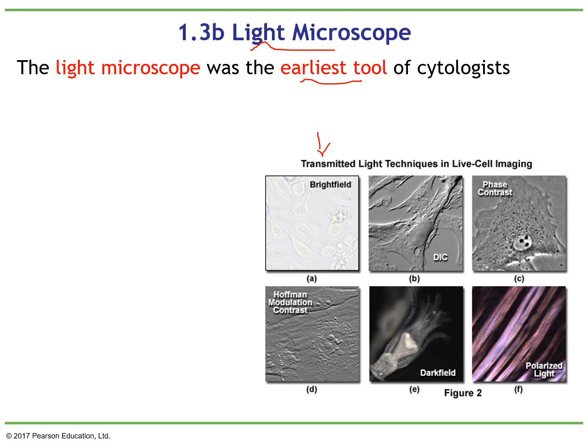You can stop this video and try to think about it: could you see in the bright field? Do you see something? Do you see what is the problem? What do you notice about this one? Question, is this a two-dimensional or a three-dimensional picture? Okay, what is the difference between this one, phase contrast, and this one, dark field? Okay, what is the difference in the contrast and the polarized light? Okay, what is happening here? So I want you to observe those.